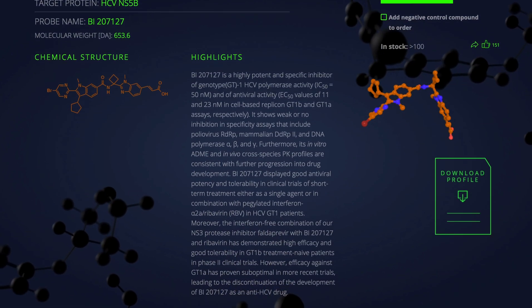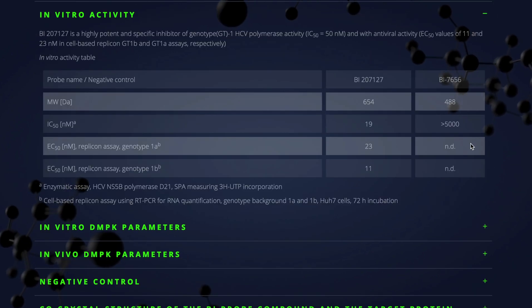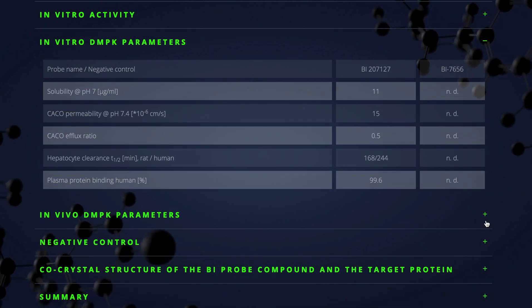This one in particular is a treatment called Deliobuvir. This is an inhibitor that's been in clinical trials and could be really useful in laboratory research. Let's go ahead and start the unboxing.